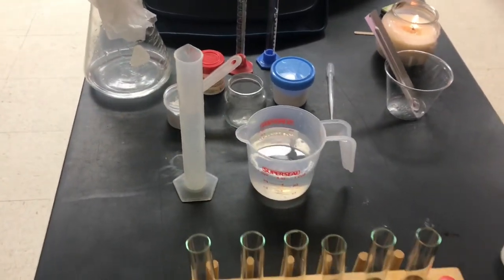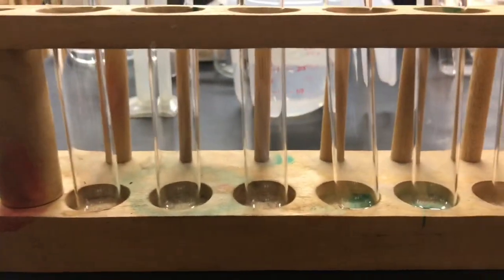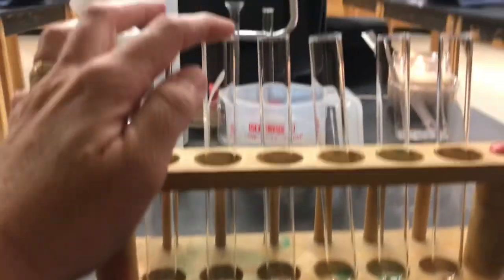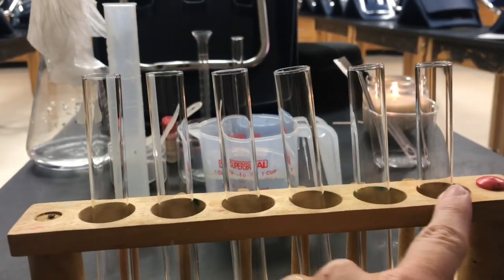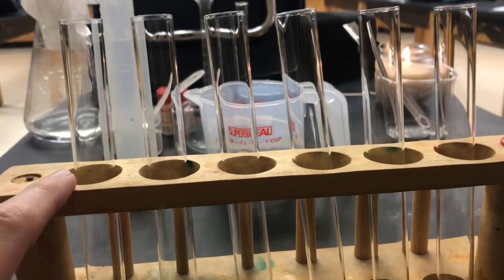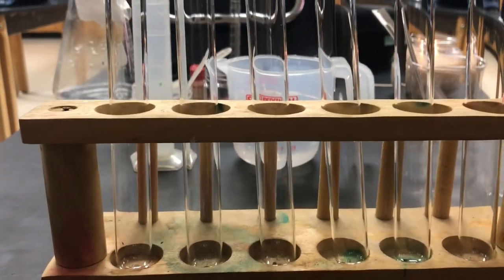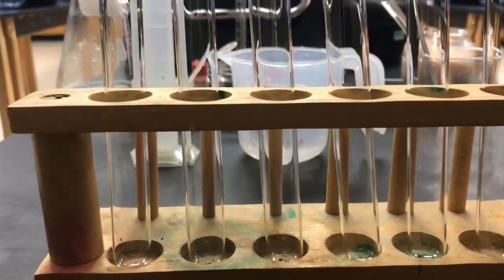What I'm going to do first is fill up our test tubes. Each one of these test tubes gets a different amount of water, starting with zero mils of water, then two, four, six, eight, and ten. Once we get our water into each one, we're going to put five milliliters of hydrochloric acid into each one as well.